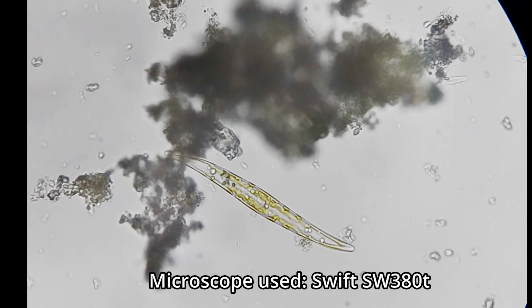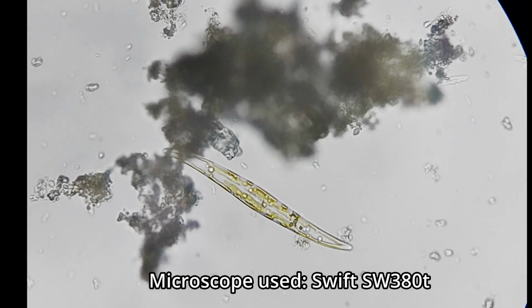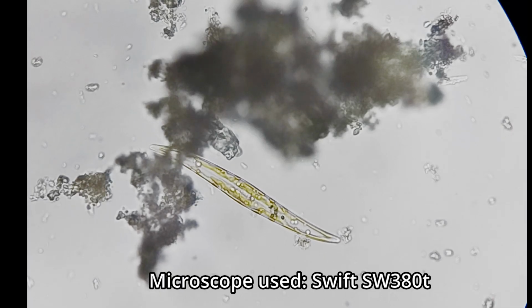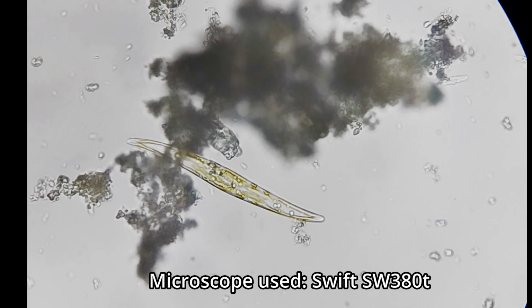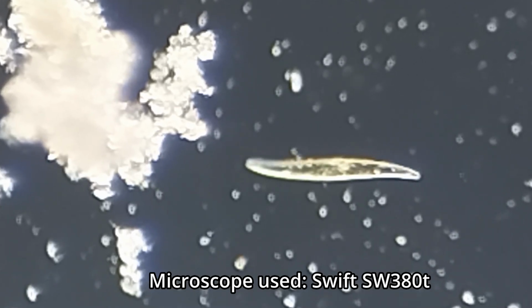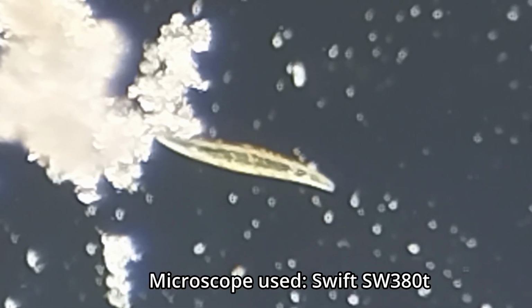In the sediment, I found diatoms. This one is much longer and pointier than the one shown earlier, leading me to conclude that it's a different species. This is what it looks like when illuminated using dark field illumination.